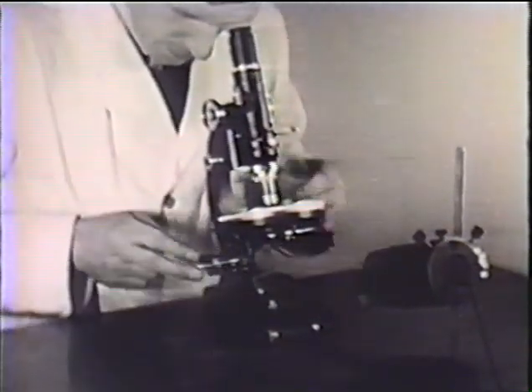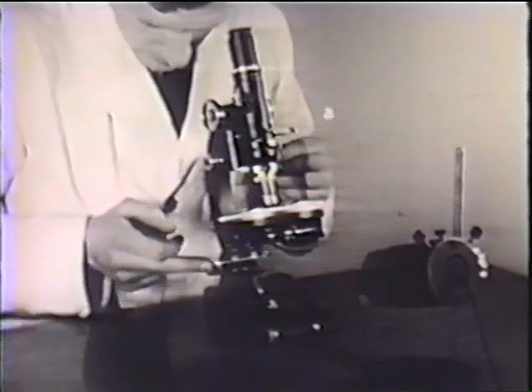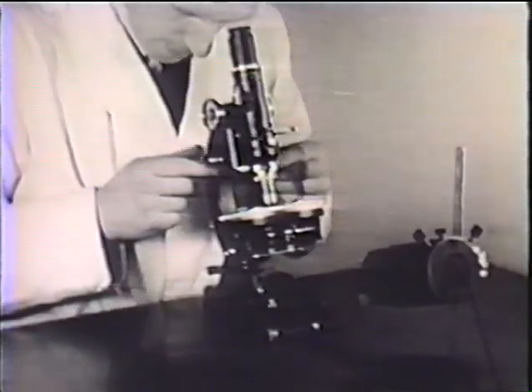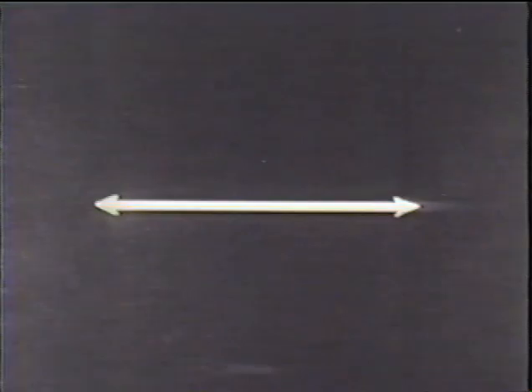Up to this point we've not used the polarizing equipment. We'll now swing the polarizer into position. The field is now illuminated with light vibrating east and west.